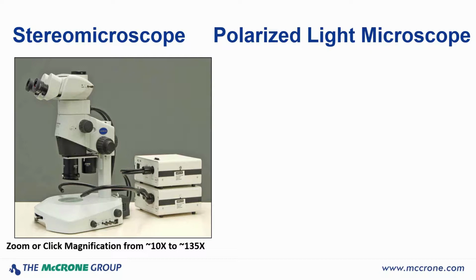Standard stereomicroscope. I say standard. It's not really standard. It's a very beefed up microscope. It's basically no different than what you used in high school biology or perhaps biology or entomology in college, but we've added a lot of things to it.